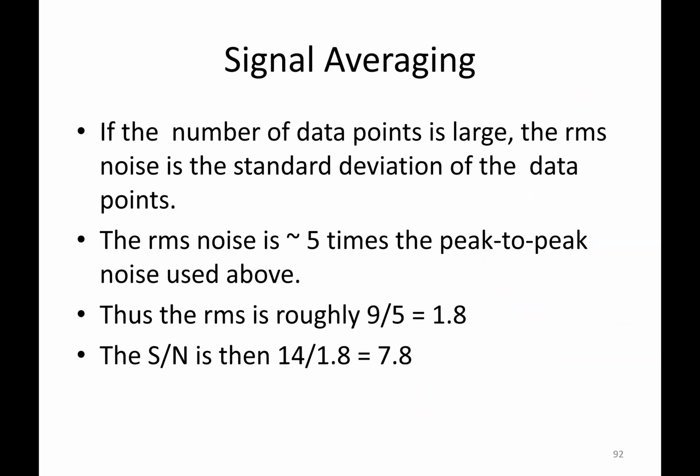In the case that you have, because the peak is not well defined at the top, you can even measure from the middle to the top. Does that make sense? You can do that because it's not so noisy. Does that make sense, class? Okay. The middle one you can see. And you notice that it starts from 2. It's actually 1 there. You can take the middle of that. If you read that, then you can measure the baseline to the very top.